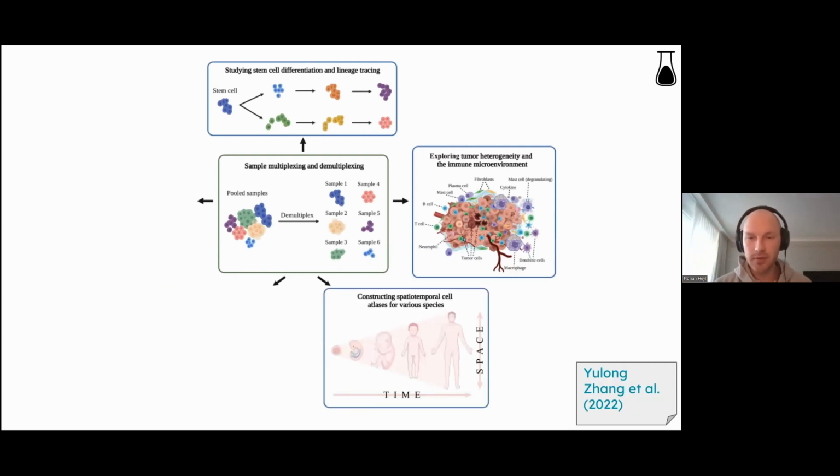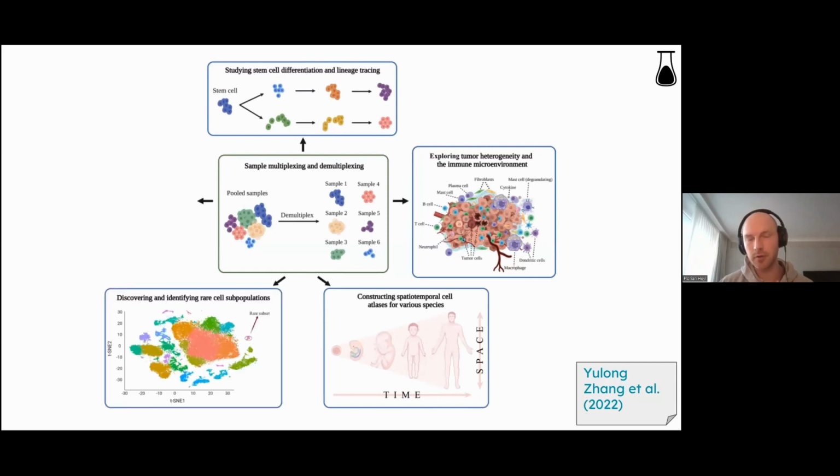There's also the spatial. You can nowadays do spatial single cell sequencing. So you also get spatial information about the cell type composition or cell stage composition during the development of a human, which is also important to know about different cell compositions in your body, and therefore also important for drug discoveries.